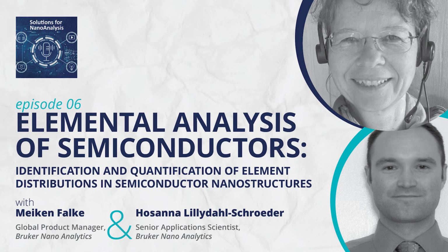Here I would like to mention a paper by Roland Pantel from ST Microelectronics. It was published in Ultramicroscopy, I think even 10 years ago now, and it describes the analysis of phosphorus and arsenic distribution using EDS, and we are speaking really of dopant level distribution.